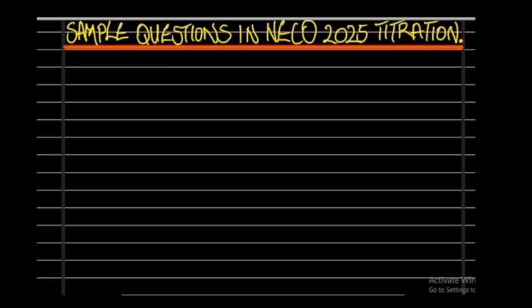Quickly want to look at some sample questions for our quantitative analysis in the NECO 2025, the ongoing examination, talking about some titration questions. We want to use these questions to prepare ourselves in expectation of possible questions that we might come across in the NECO practical examination.